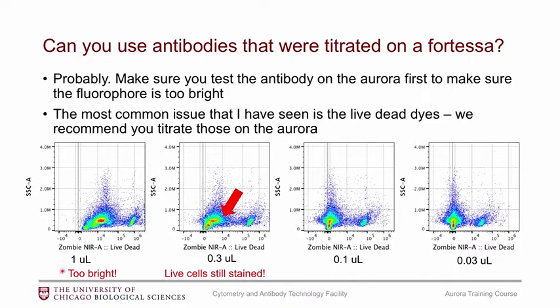BioLegend recommends one microliter in a hundred microliters of PBS for Zombie Near IR. At that concentration the data is on scale, but the raw data shows that the live cell population contains the Zombie Near IR signature. If you titrate it down, the live cells look much more negative with a lot less non-specific Zombie Near IR binding. You get way better results using a lower concentration.